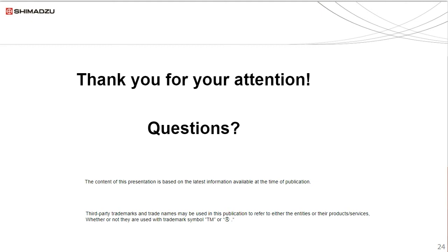And we did go into some detail about this in looking at the slides here. Slide number 17. It depends also on what type of variability you're seeing. If you're seeing a gradual decrease in the signal and that's causing RSDs to be high, or if it's rising, versus if it's completely scattered, tells you different information, and dictates the approach to fixing that problem depending on what you're seeing.